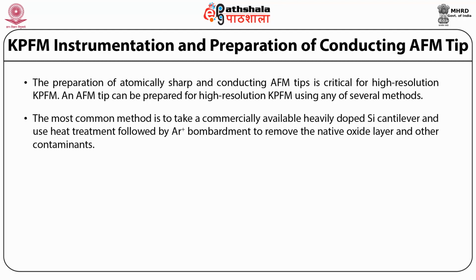The most common method is to take a commercially available heavily doped silicon cantilever and use heat treatment followed by argon ion bombardment to remove the native oxide layer and other contaminants. The tips routinely produce high resolution images but are more likely to pick up surface atoms, altering the work function of the tip.